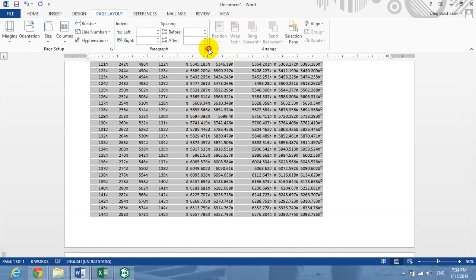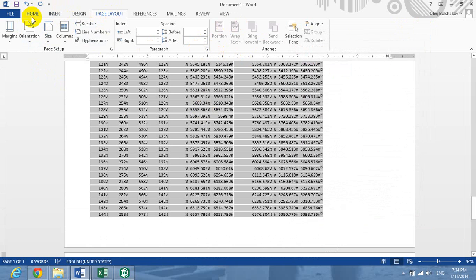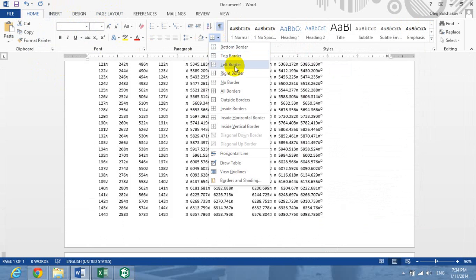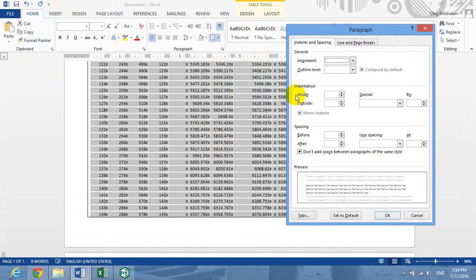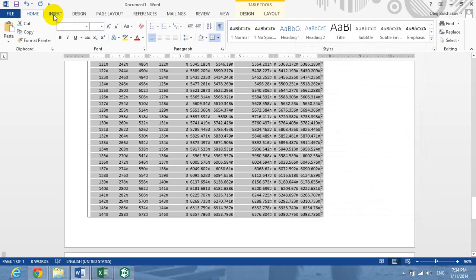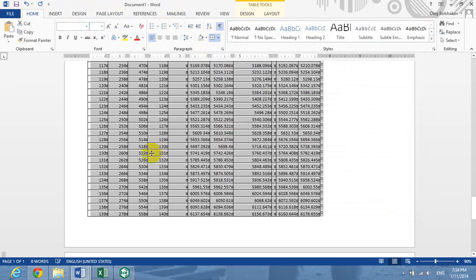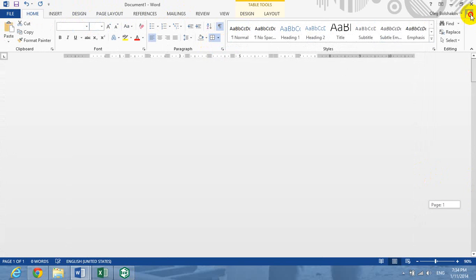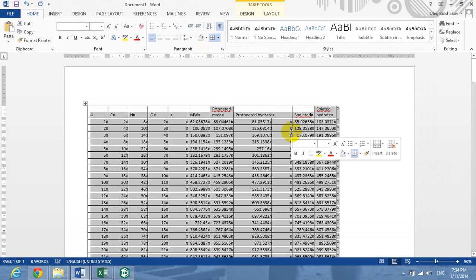Make sure everything has all borders for your convenience. Now we have the names: sodiated, hydrated, protonated. Good luck with it.